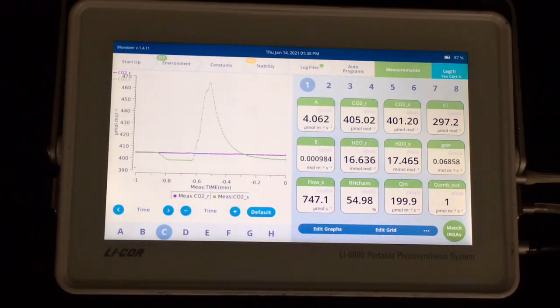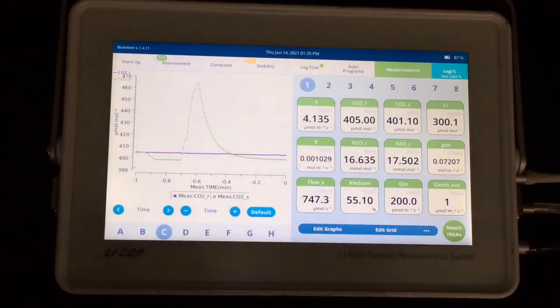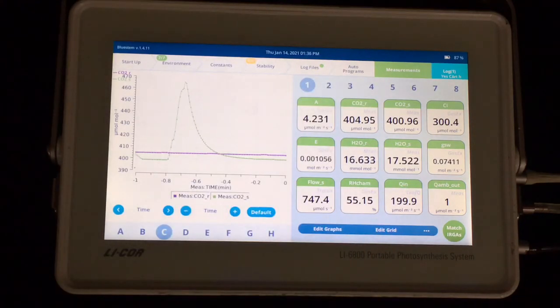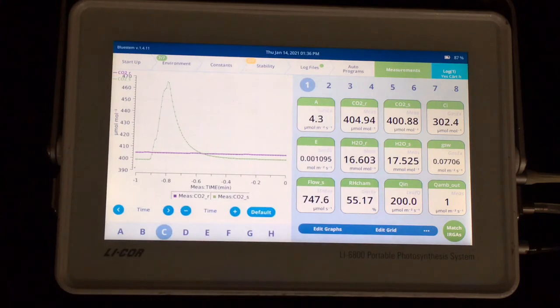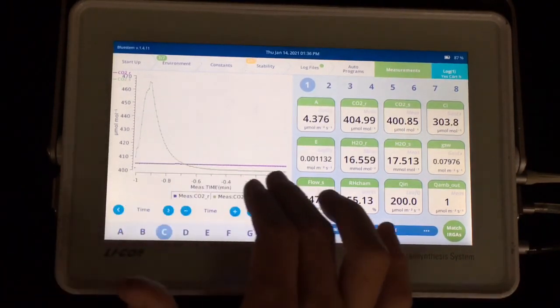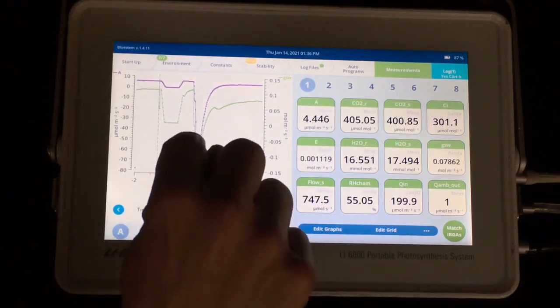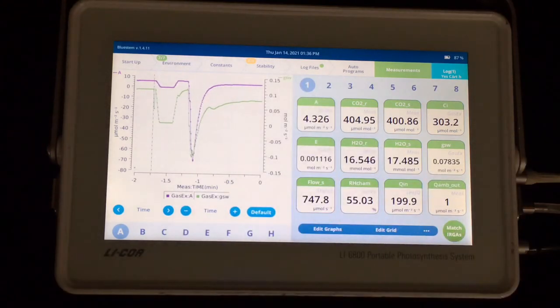And you can decide to log based on a number. You can watch these graphs and see when things look stable. You can use stability criteria which can be very helpful. And objectively decide when the slope or rate of change of these variables. Whichever variables you find most useful. Gets below a threshold you can use that to log. So a lot of people will look at CO2 graphs. Or again you can watch the graph of assimilation. And you can see that in this purple line here. Is now rest stable and I would be ready to log that data point.